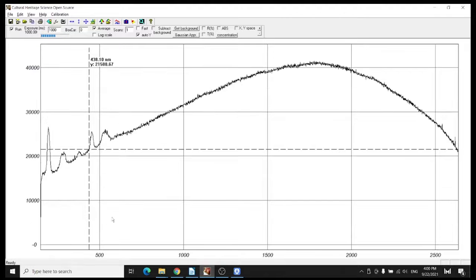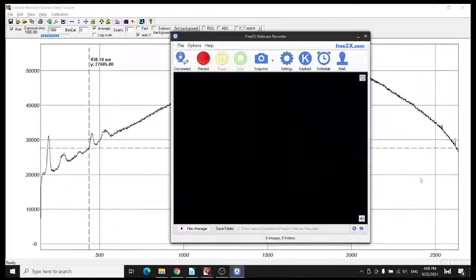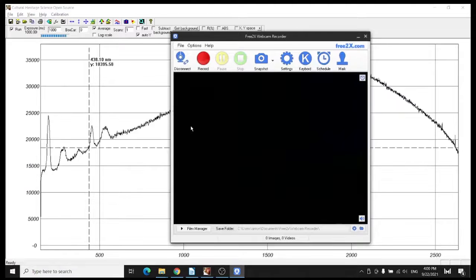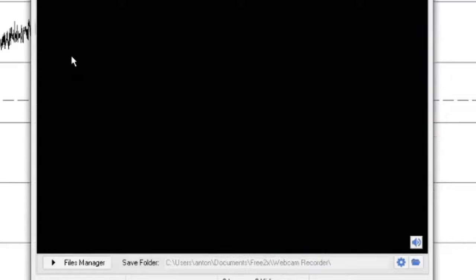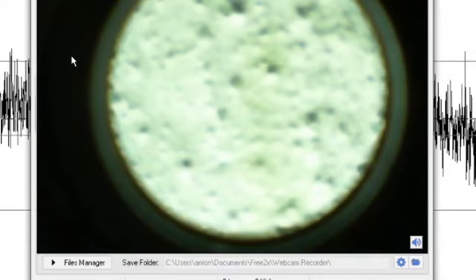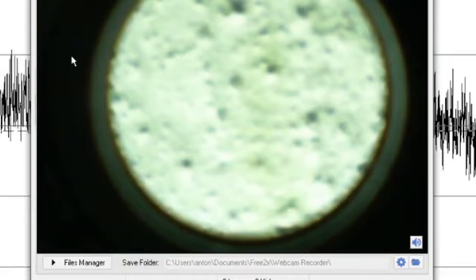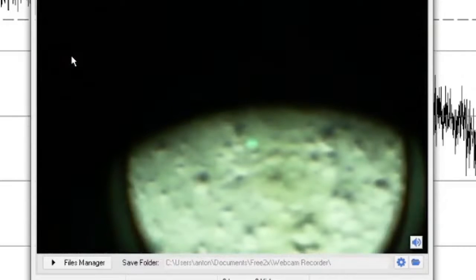If we go back to the image, you see now the camera is dark because the switch is on. So I go back to the position, I turn on my light, and now I see the lead tin yellow, but it is a bit out of focus, which is what we expected to see. By the way, this is important.